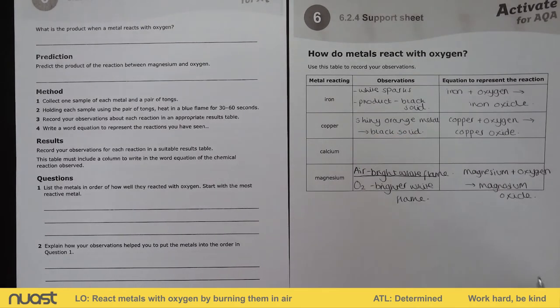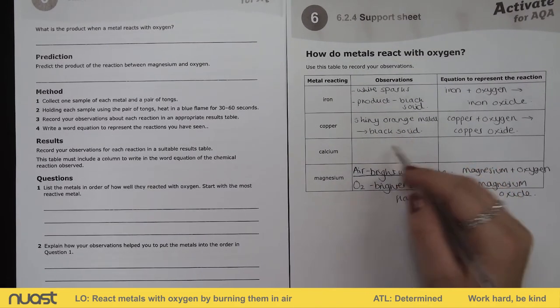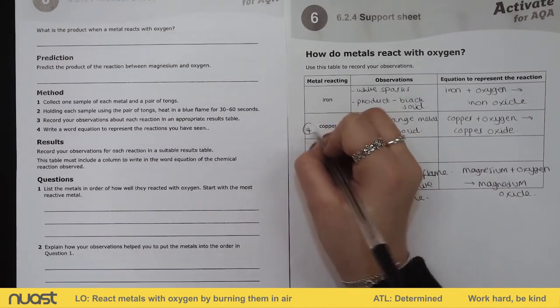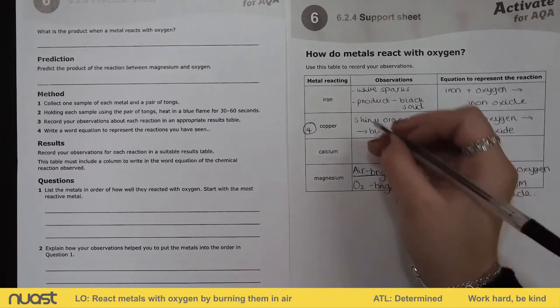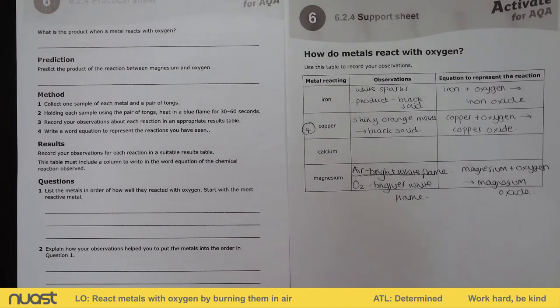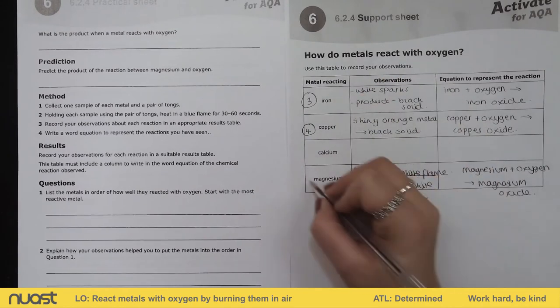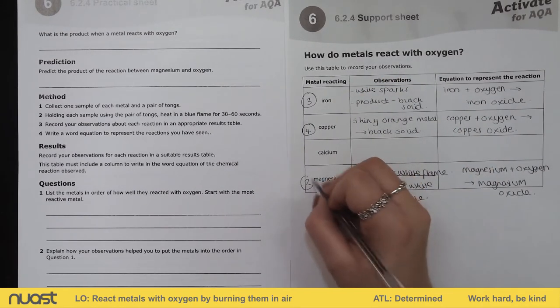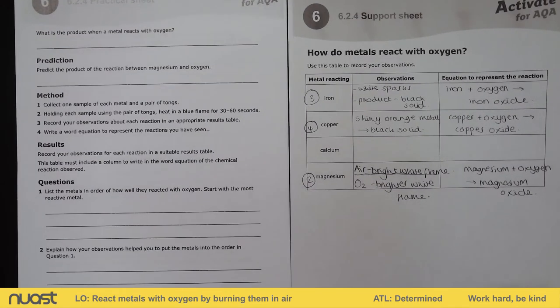the copper, we didn't see any flame or any sparks when we did the copper. We just saw that black solid being formed. So I would say this was the least reactive. So we're going to name that number four. Iron was definitely less reactive than the magnesium because we only got a few white sparks as we passed that through the Bunsen burner. And then we have our magnesium that at the moment is our most reactive. So let's have a look at calcium and see where that fits in.